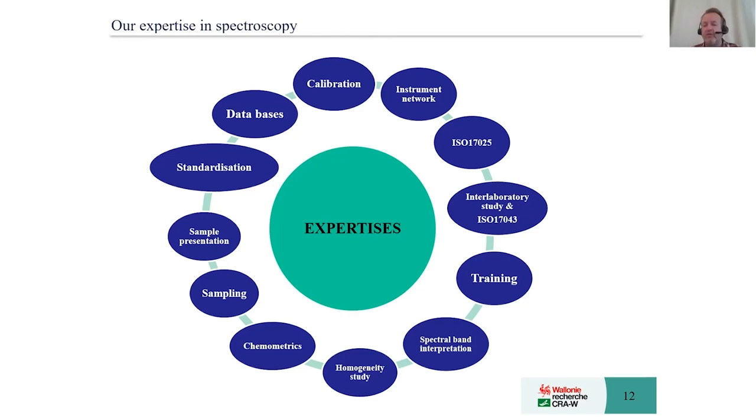And so we need to be able to calibrate. And here you have different expertise that we have developed with time. It's transfer of data, standardization, all about sample presentation. It's simple spectroscopy, but the way you present the samples is very important, because you can make a big mistake there and then not have what you want.